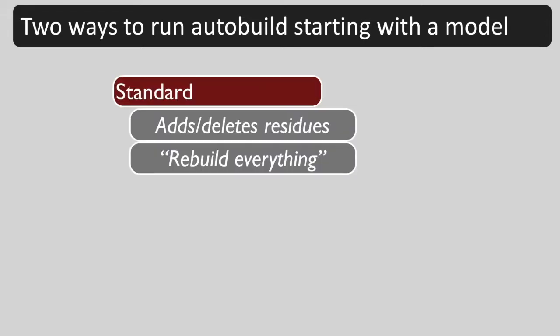In case we are starting with a model, we have two main choices of how to use this model. Standard rebuilding adds and deletes residues as necessary. It rebuilds everything.